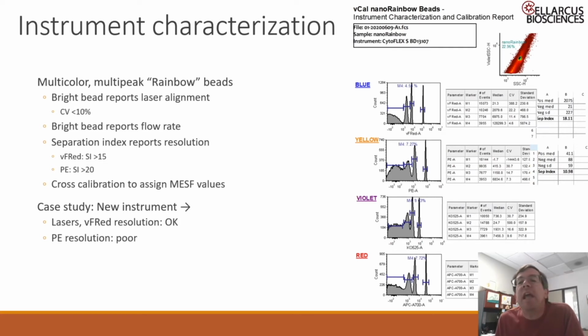We use the CV of the bright bead to report on laser alignment to make sure our lasers are well aligned across all lasers.